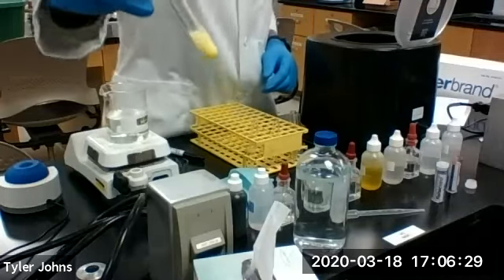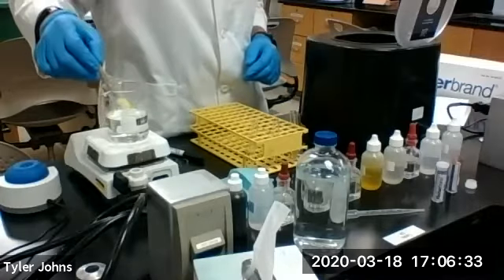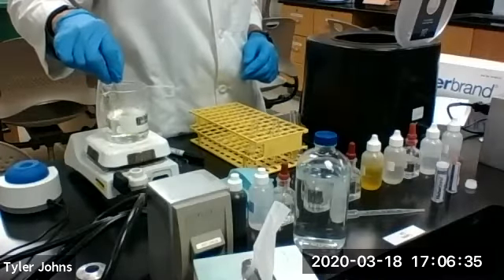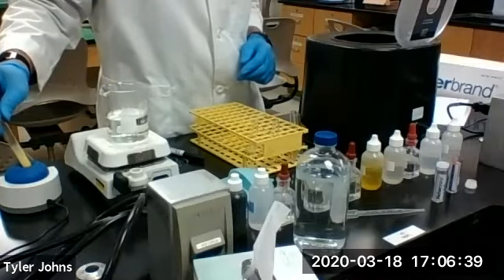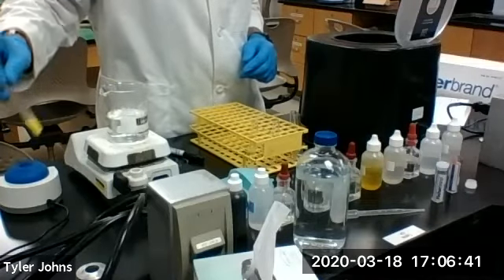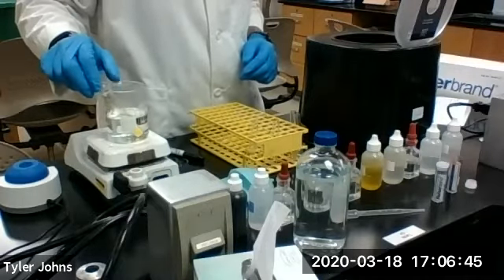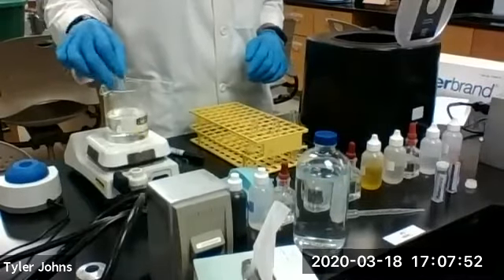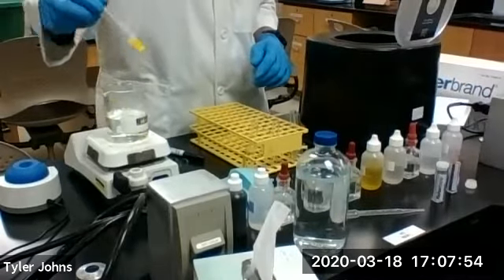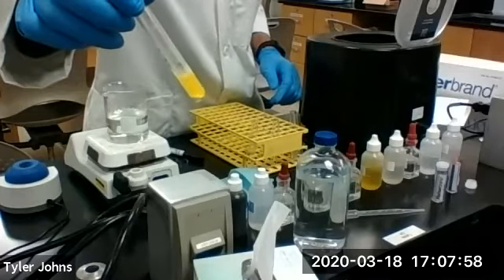Now we are going to warm and agitate this mixture. Okay, our solution has been sufficiently warmed and agitated.